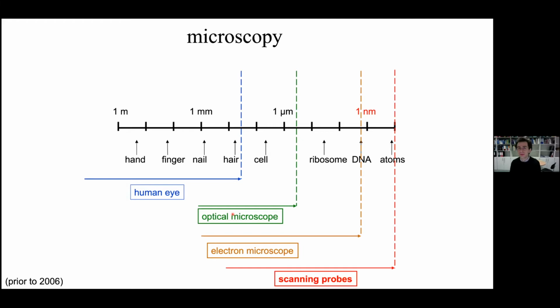about optical microscopy. Microscopy in general, and this shouldn't be a surprise to you, is basically the attempt of humans to expand the resolving power of their eye. And optical microscopy, which includes fluorescence microscopy, was actually one of the first steps in this direction, which brought the ability to resolve objects below 1 micrometer in size. However, over the last century, there have been definitely even more powerful steps towards increased spatial resolution.